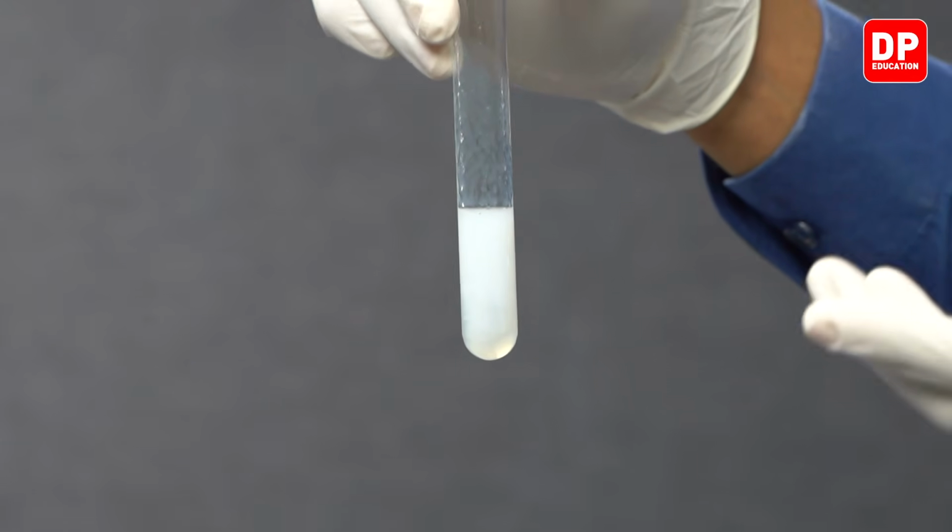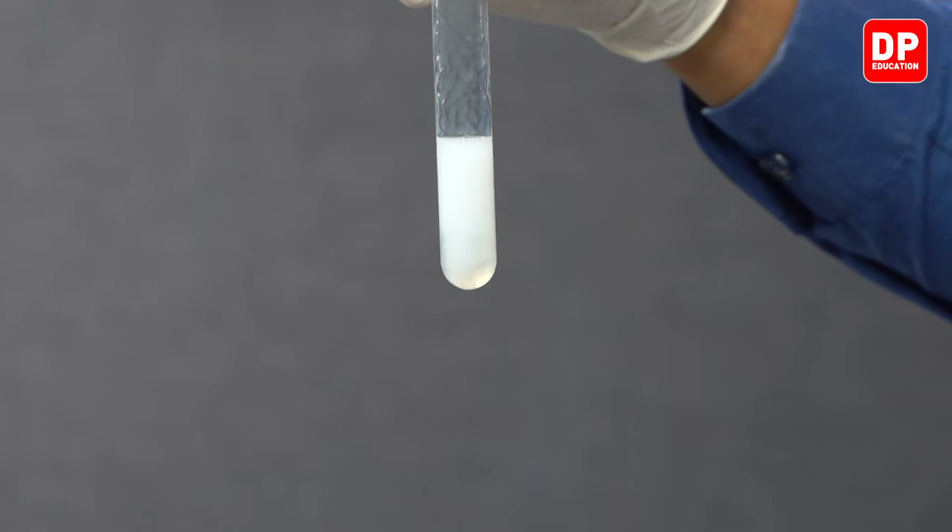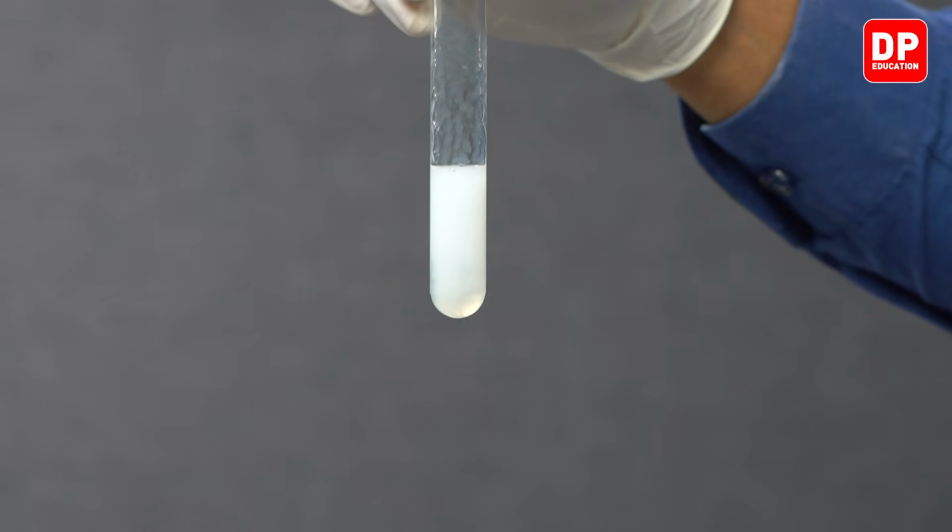Instead, excess magnesium 2+ ions that were present in the medium will start forming more and more magnesium hydroxide white color precipitate. So magnesium hydroxide is not an amphoteric hydroxide. In fact, magnesium hydroxide only reacts with hydrochloric acid and it dissolves in hydrochloric acid but not in excess sodium hydroxide.